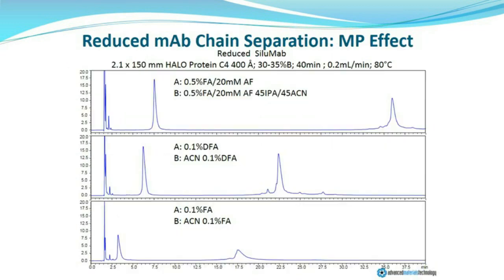Same thing can be done using difluoroacetic acid with similar chromatographic performance, desirable characteristics. And also shown on the bottom here is the reason why we've looked a little further afield in terms of acid modifiers: the formic acid-based separation is rather poor, the peaks are broad, and in fact recovery is inadequate.